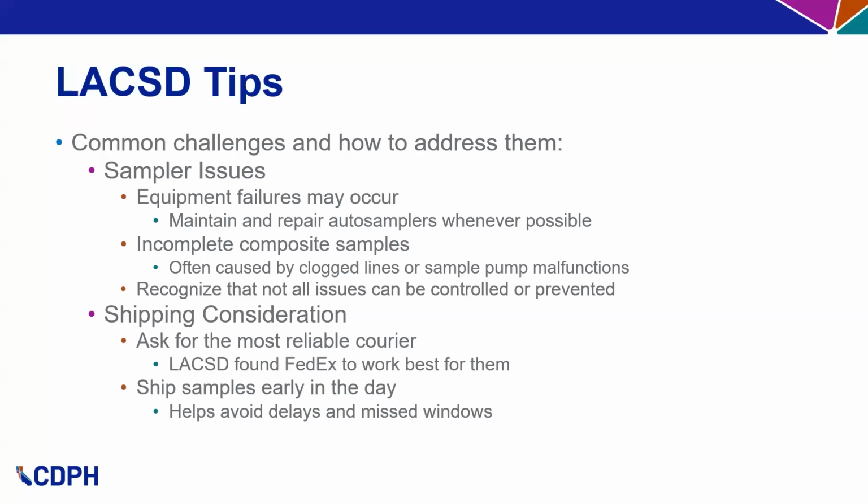The other thing too is they say shipping samples early in the day helps avoid delays and missed windows. For example, you can sometimes just schedule a shipping period to be occurring within 4 hours. So sometimes it's like 8 to 12, or even 1 to 4 or 1 to 5.